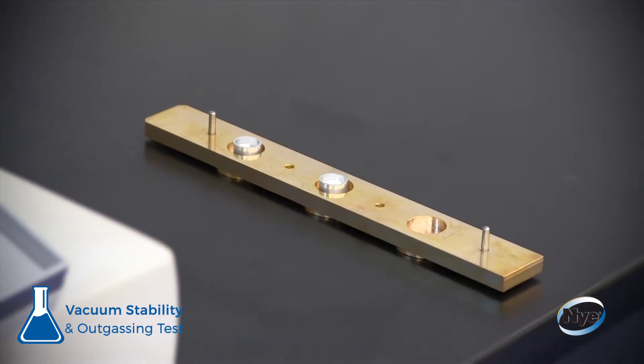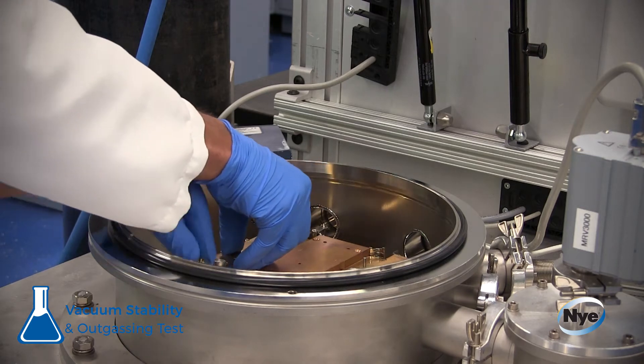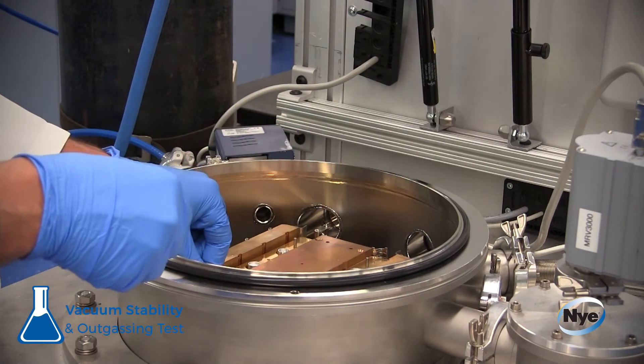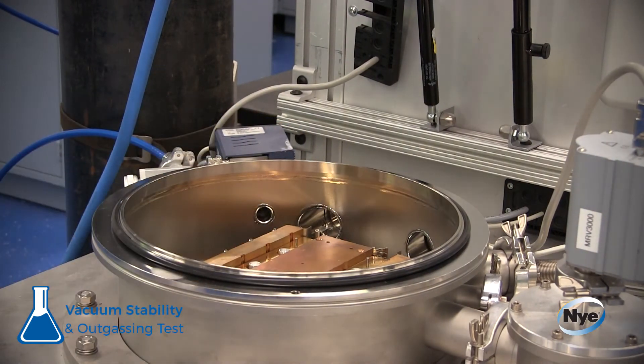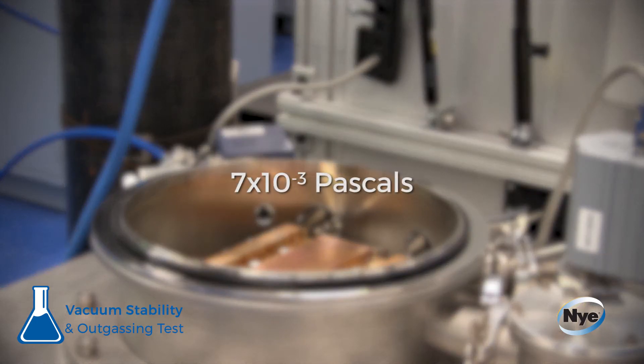The typical test can run up to two different materials at a time. After all the samples are weighed and loaded into the chamber, it is then evacuated to a vacuum level of at least 7 times 10 to the negative 3 pascals or 5 times 10 to the negative 5 torr.